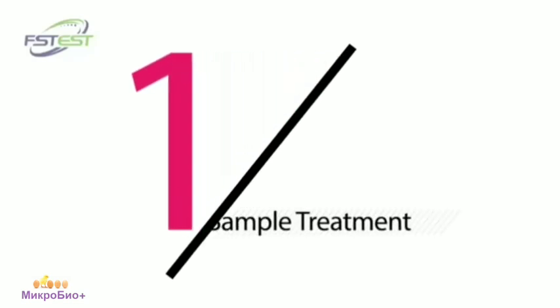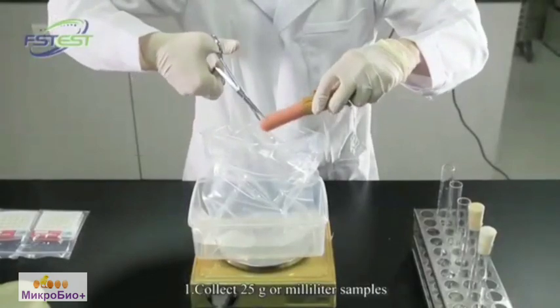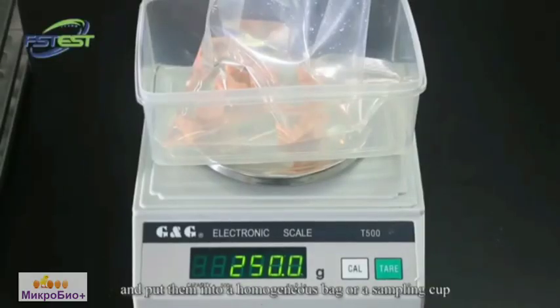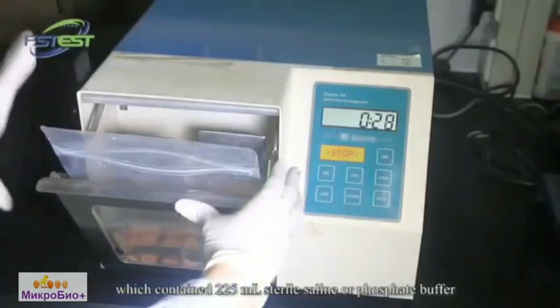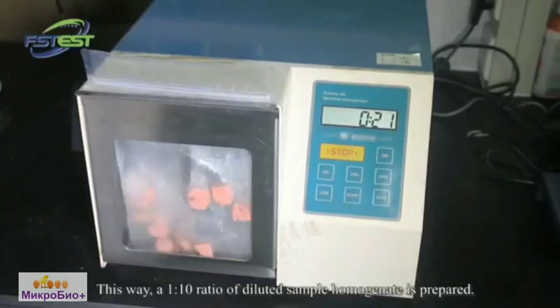Sample Treatment. Collect 25 grams or milliliter samples and put them into a homogenizer bag or a sampling cup, which contains 225 milliliters of sterile saline or phosphate buffer. This way, a 1 to 10 ratio of diluted sample homogenate is prepared.